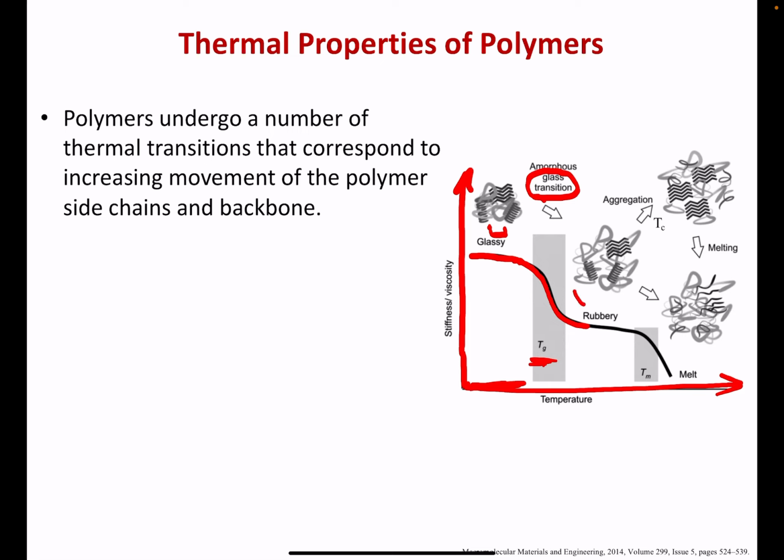As you see here in this rubbery state, where polymers are less brittle, we still have some crystallites present, represented by the figures in here that have chevrons or what appear to be springs, showing packed chains. Moving the temperature up past the rubbery plateau, a melt can occur where all crystallites melt and disorder, and now those packed arrangements are gone in our diagram.